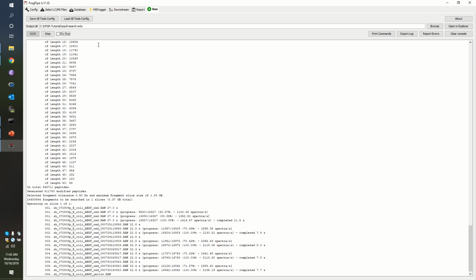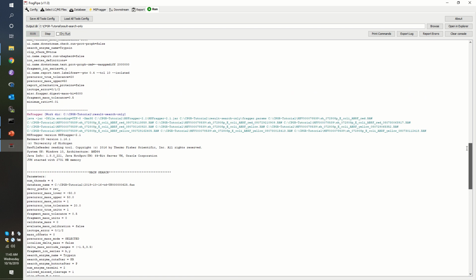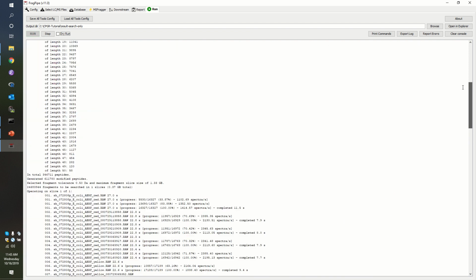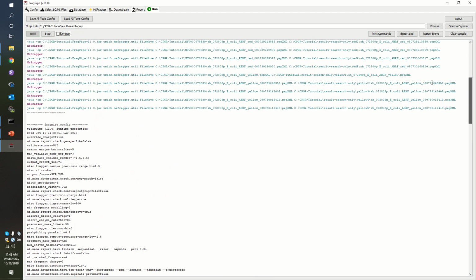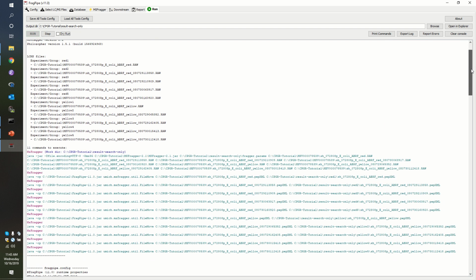Teacher's privilege. Okay, great. So things are happening behind me on screen, and it's worth exploring what that entails. The first one, I'm going to just roll backwards, so I'm going to move the thumbtack back a little bit. I mentioned that we had a whole bunch of configuration information. Up here at the top, you can see that the configuration information is being reported.